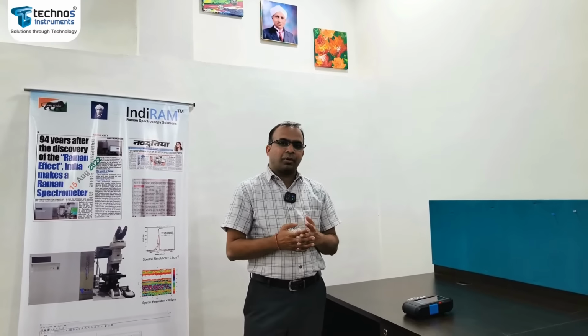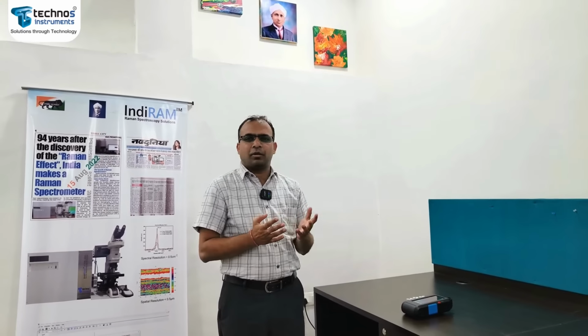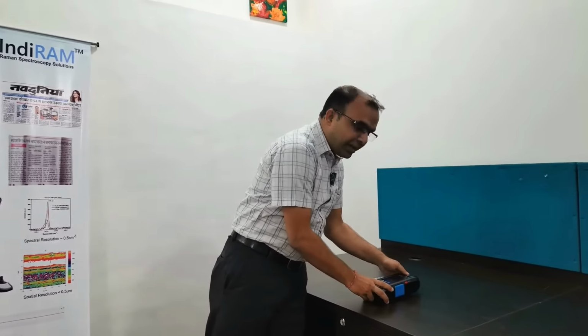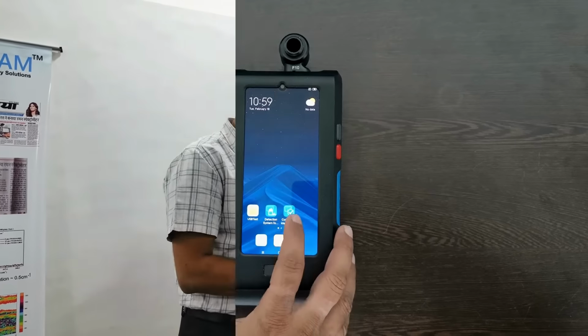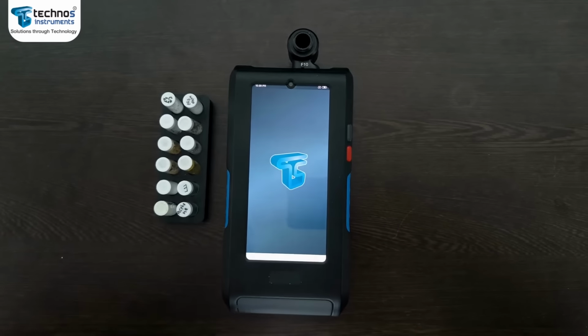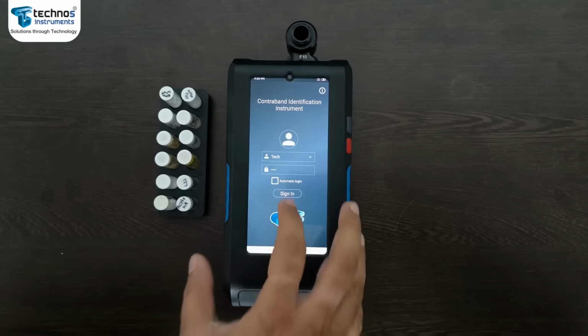So we have with us commonly found raw materials from APIs like metronidazole and azithromycin and some solvents like ethanol, acetone, etc. So let's see how IndiRAM handheld Raman spectrometer can be used to identify these pharmaceutical raw materials. So IndiRAM 1064 nanometer handheld Raman spectrometer is a 21 CFR Part 11 compliant system.